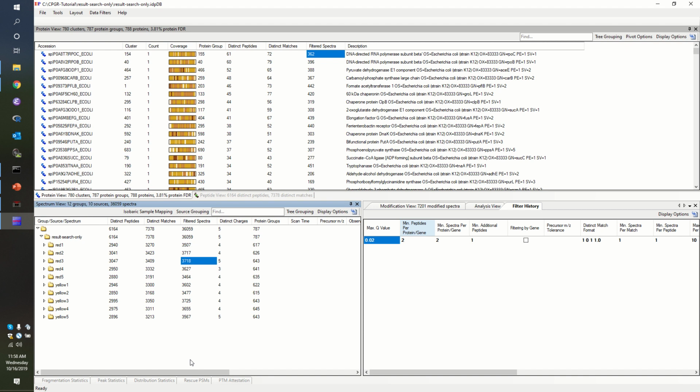So do we think of that as an acceptable range, or is that just wild and crazy gyration in the mass spec? Should it identify exactly the same number of spectra every time? We have a yes, we have a no. The mass spec has what seems like a relatively random process for deciding which peptides get fragmented every time.